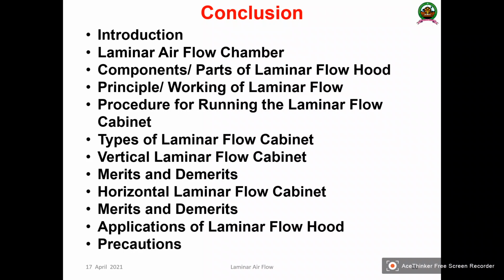The class begins with a brief introduction of what a laminar airflow chamber is and the comparison between laminar airflow and biosafety cabinets, the components or structural parts of the laminar airflow hood, the principle or working of laminar airflow, the procedure for running the laminar airflow cabinet, the different types of laminar airflow, vertical and horizontal, their merits and demerits, the applications of the laminar airflow hood, and the precautions we should adopt when working with the laminar airflow.